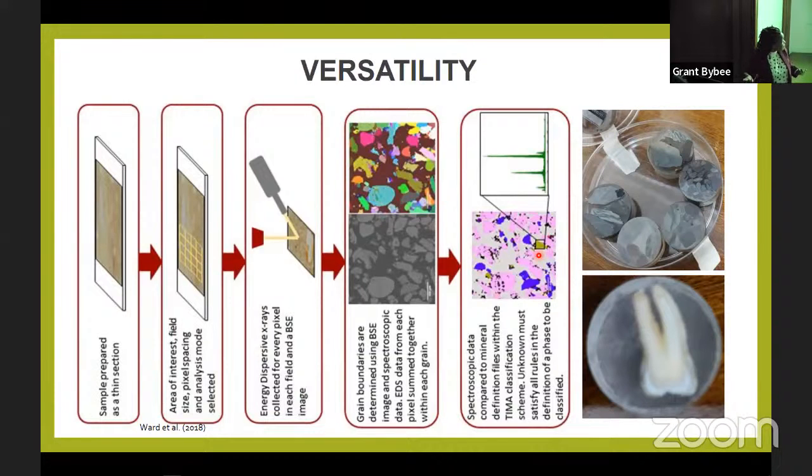If it's a magnesium-rich garnet, it just gives it as orthopyroxene. So as a person who knows your sample, it becomes your duty to understand, listen, I know my sample, at least I can have orthopyroxene here. But again, in most cases, it does a very good job. And also these are different samples here. I found that very interesting.